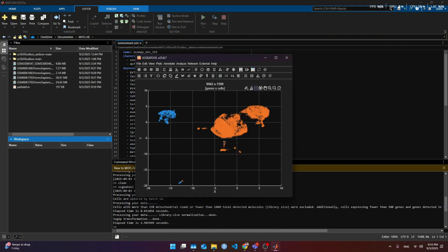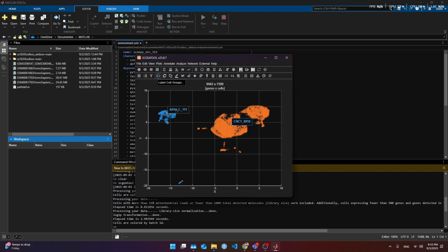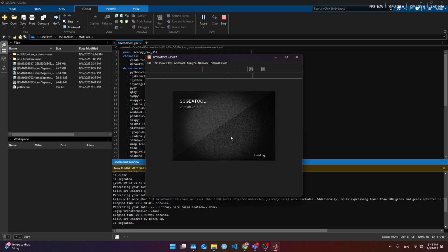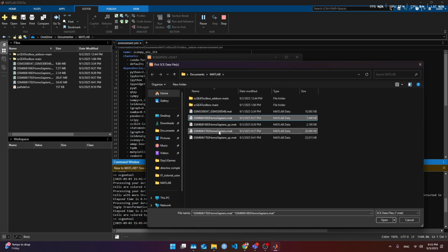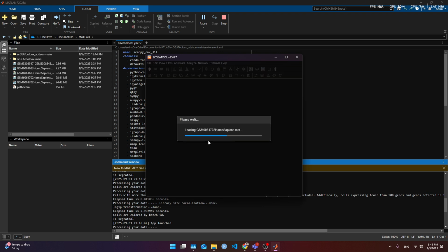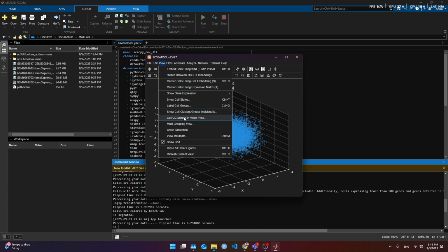All right, it finished, and this is how it looks. Once again, I look at the batches, and this is how they look. They have a batch effect, so we don't know if it is biological batch effect or data-driven batch effect, but we just look at that, and that's what it is. Now, what we're gonna do again is the same, but with the samples that are not QC. So we're gonna load the two of them that have not been QC, we merge, we intersect, and we look again at the QC matrix just to be sure.